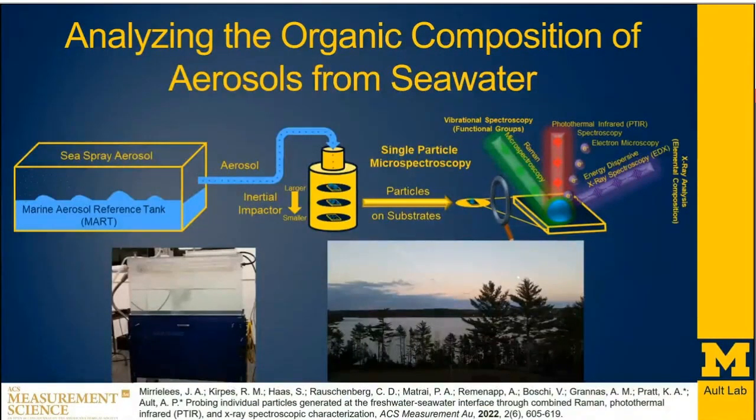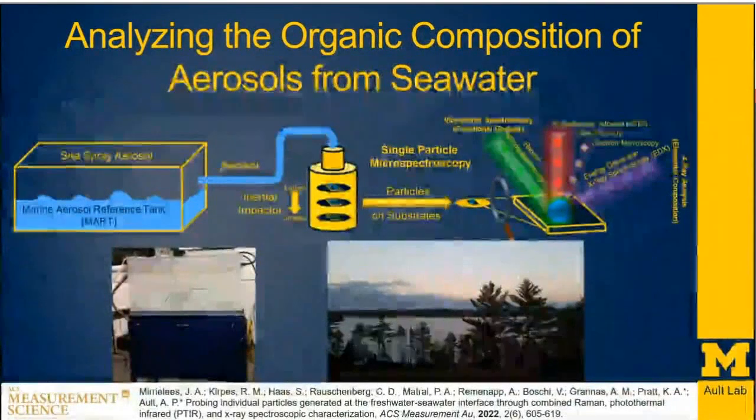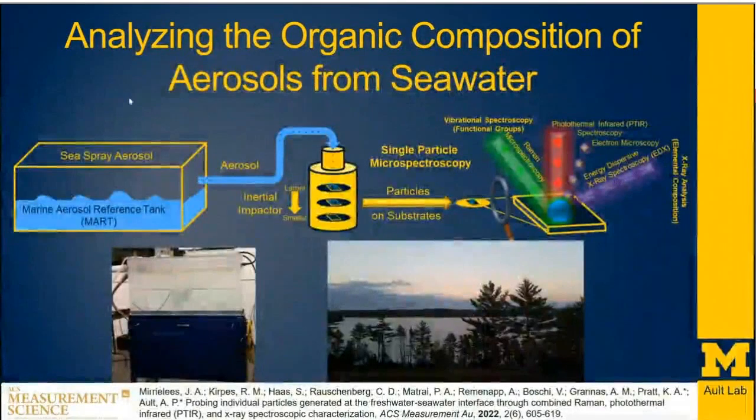So that established that we could look at this with controlled samples in the lab, but what happens when we start working with more complex particles? As part of an NSF-funded project with collaborators, Patty Matrai at Bigelow Ocean Sciences Lab, Carrie Pratt here at Michigan, and Amanda Grannas at Villanova, we collected particles with a marine aerosol reference tank using fresh seawater from the Gulf of Maine that you can see in the picture here in the lower right.